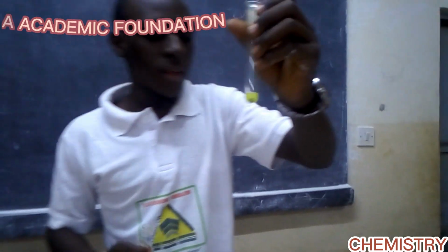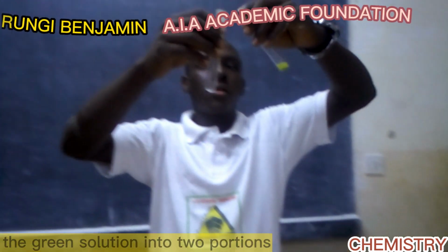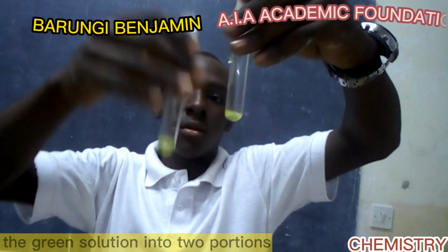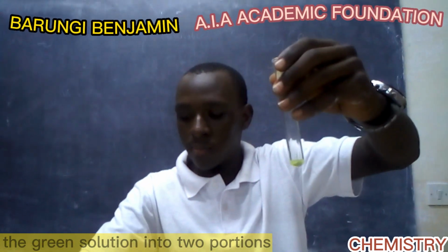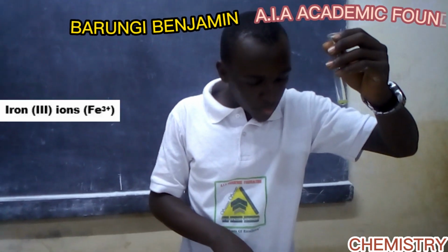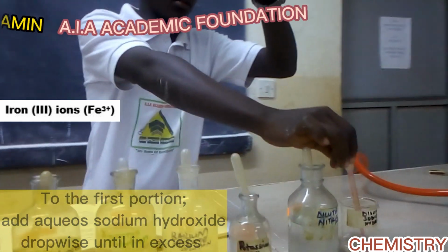So they have told us to divide the solution into 2 portions. So we are going to divide the solution into 2 portions. As you can see, we have two portions, and they said the first portion, add aqueous sodium hydroxide. So this is our sodium hydroxide.